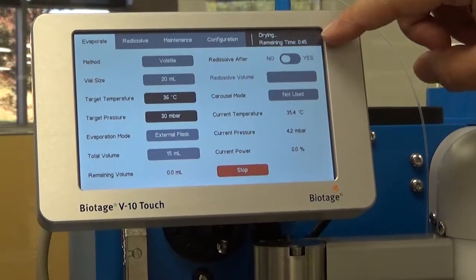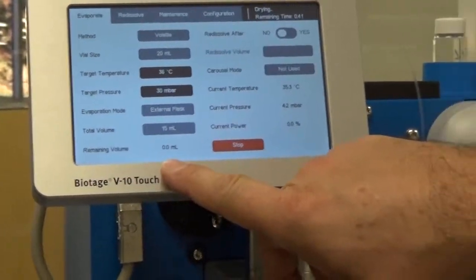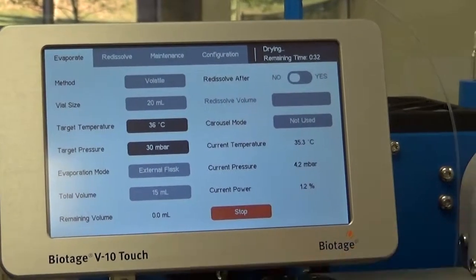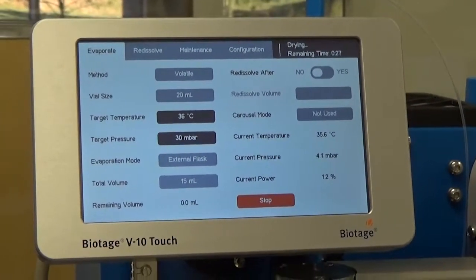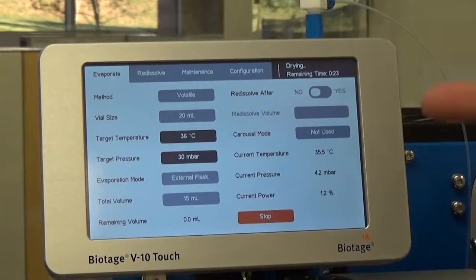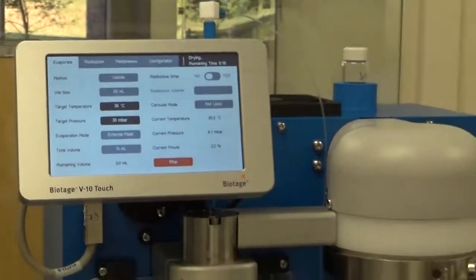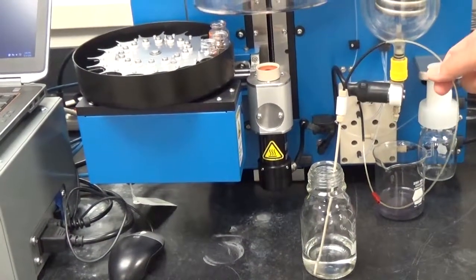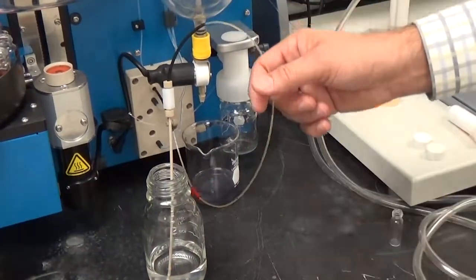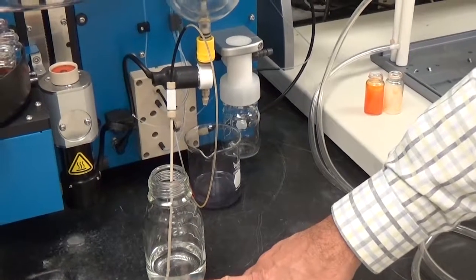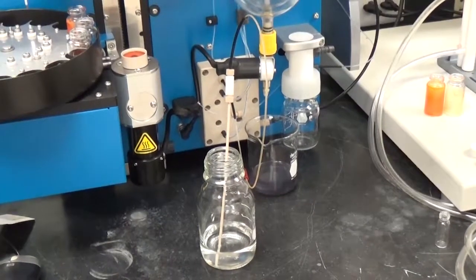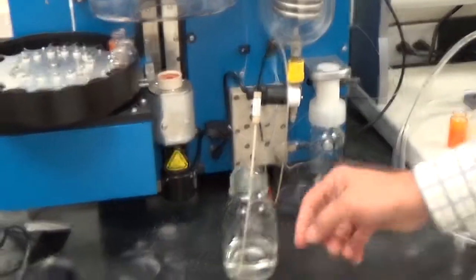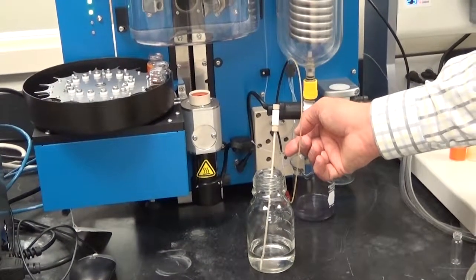Okay, so we're on our drying step, and you can see we have 46 seconds left to go. The remaining volume is recorded here. When you're using the solvent manager with the super tube like we have been just now, this tells you how much is going to be removed, has yet to be removed from the main vessel here. So right now that's down to zero, so we've added everything we're going to add. We have 23 more seconds before we're done. And let's just see what happens. So just a lot more reactive material is stuck to the side of the vessel there. And then we've still got a little bit left in the vial here, this tube. So when you run this, when you do it this way, you want to make sure that the volume in the vessel is less than the volume you programmed in. So you want this to pull this out to dryness and then pull this so that it's empty in the vial and it pulls this remaining solution out of the tubing and up into the pump.